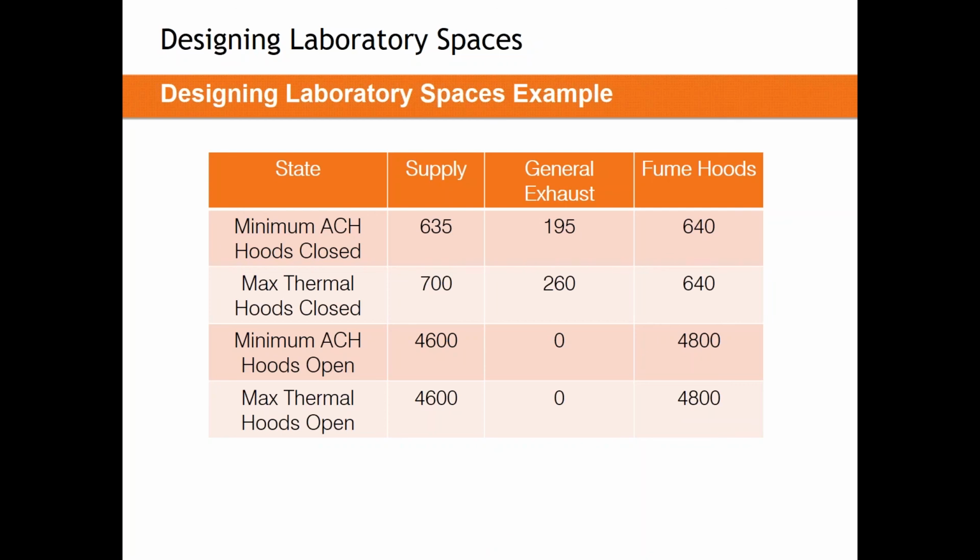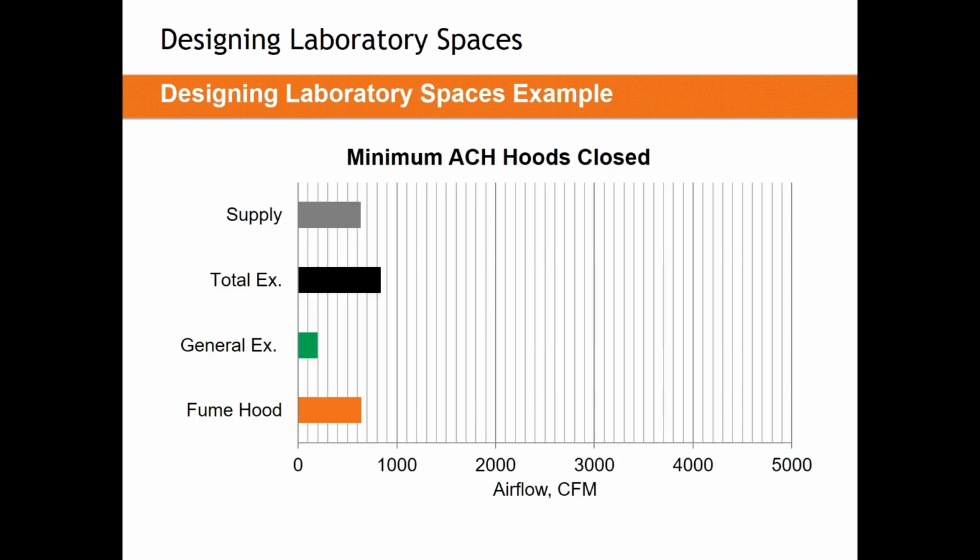When we actually open those fume hoods, they're going to start to drive our laboratory for us, however, meaning we'll need 4,800 CFM of exhaust, which means our supply has to open up to track it to 4,600. Let's put this in a slightly easier to read format.